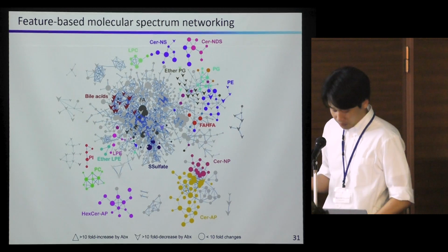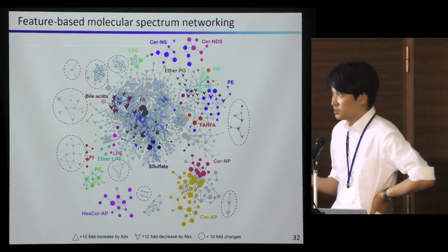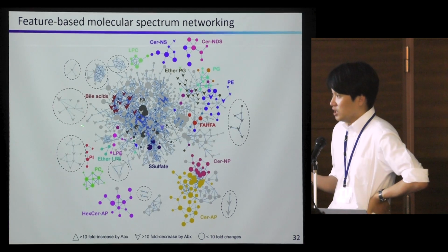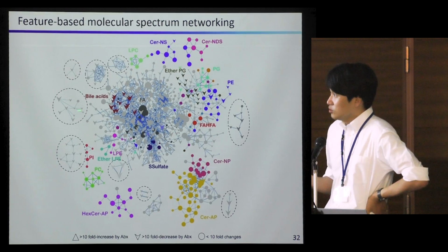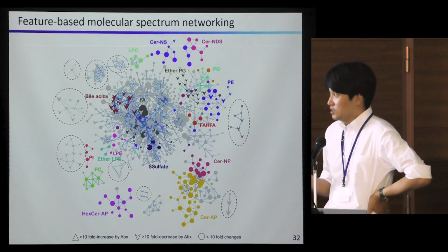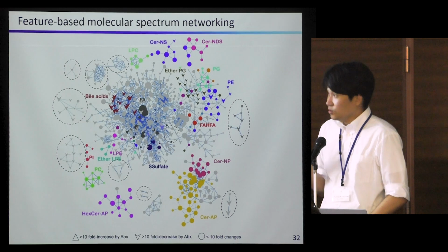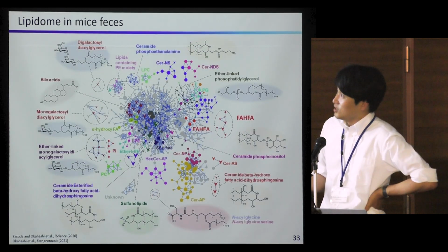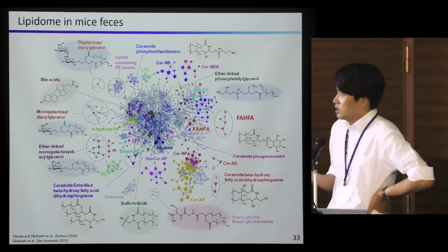And also, we found these subclusters. This shows a bacteria-dependent decrease, so these should be analyzed or interpreted. It has a higher priority for structure estimation. To make a long story short, we can successfully estimate the structures.